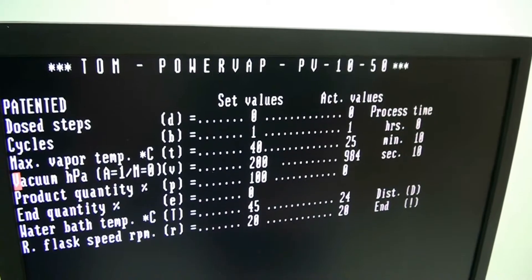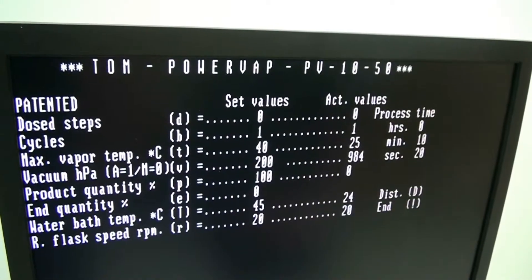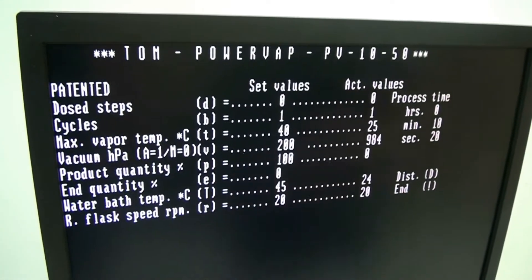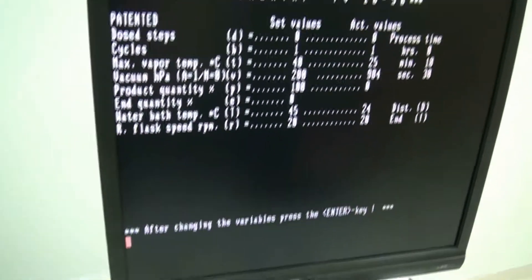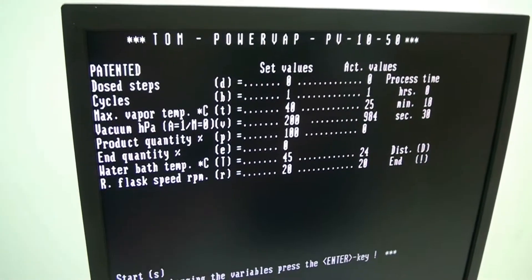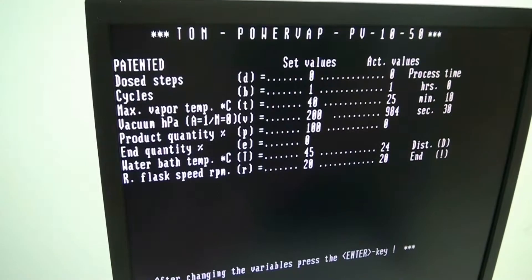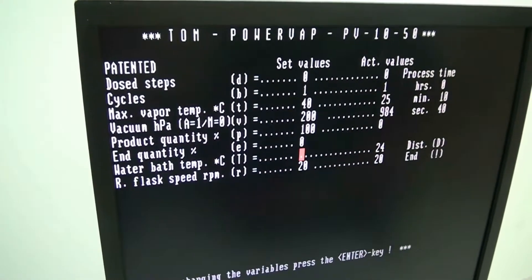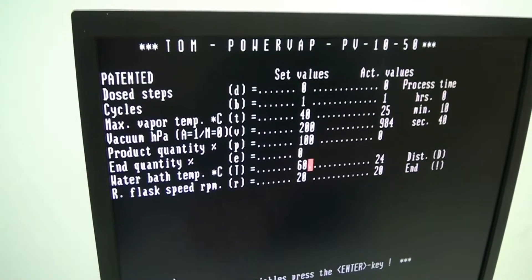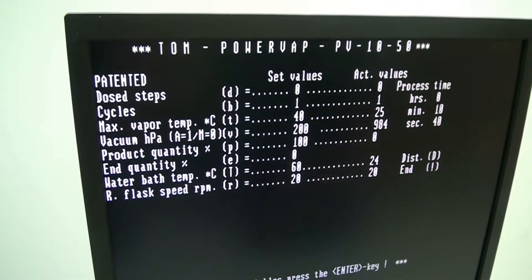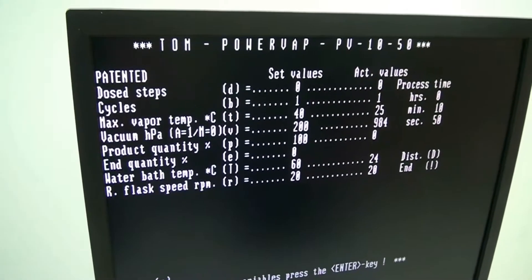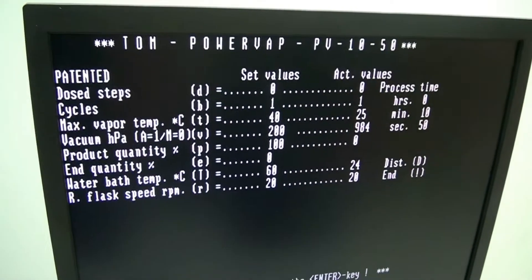When we press the start that is the setting it's going to use. If you want a warmer bath temperature, this one supports up to 60 degree bath temperature. Capital T takes you into the bath temp setup to a 60 degree mark. Again when you're ready to run, that's the setting it's going to use.